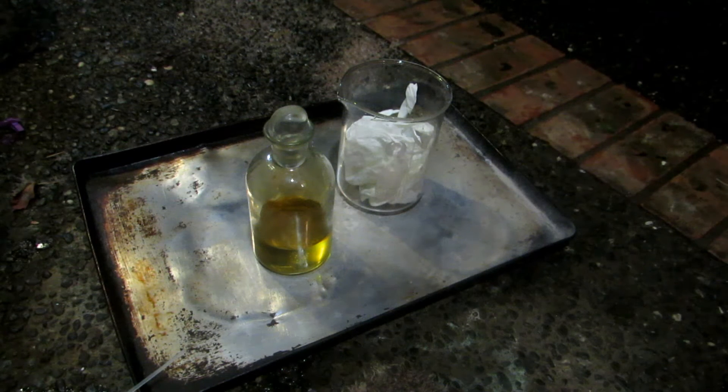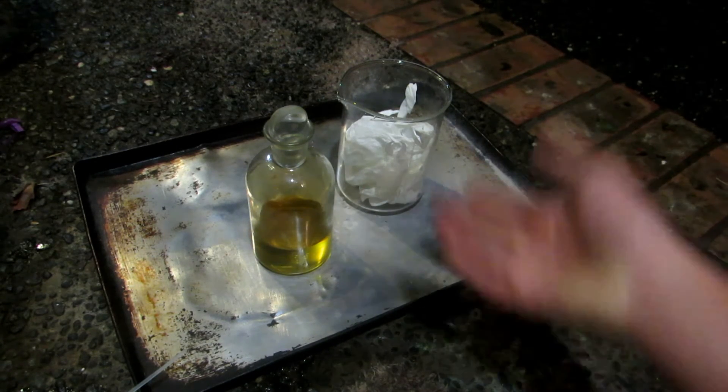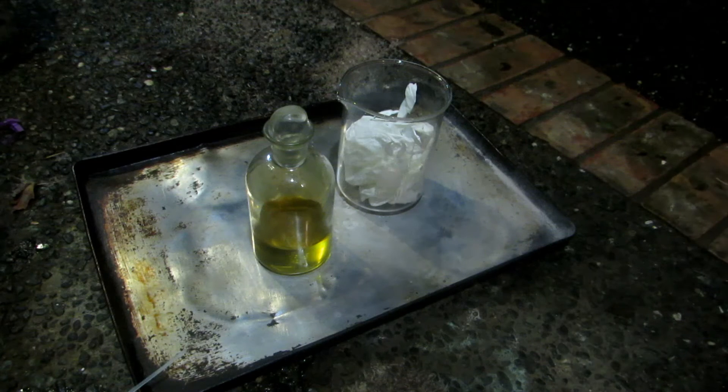Hey guys, and welcome back to another short video. Today I'm just going to be showing the reaction between nitrile gloves and highly concentrated nitric acid. These nitrile gloves were just purchased from Costco, and I use them all the time in all the experiments I do — they work excellent, I've never had anything go wrong with them. But this video is about why you should never wear them with highly concentrated nitric acid.